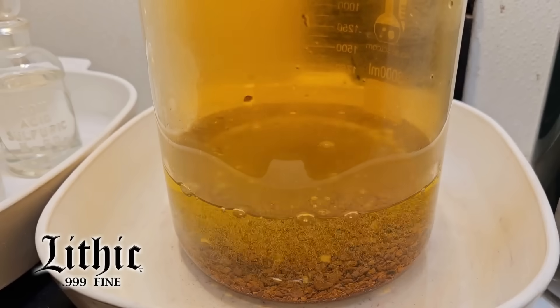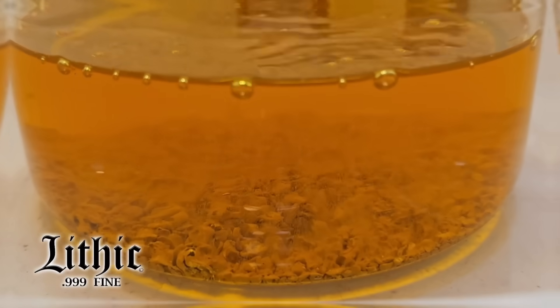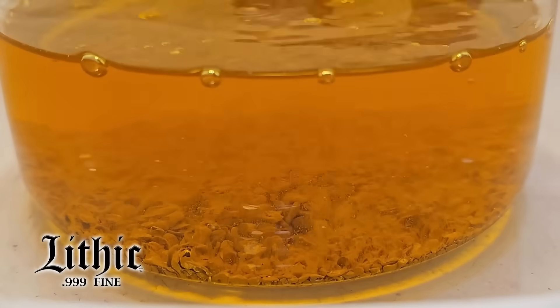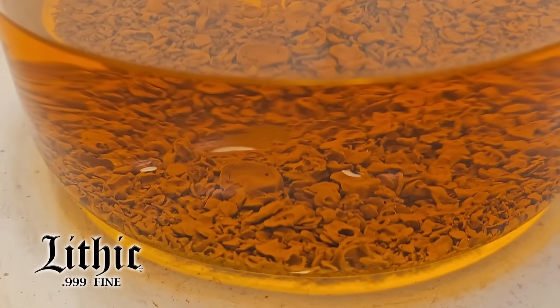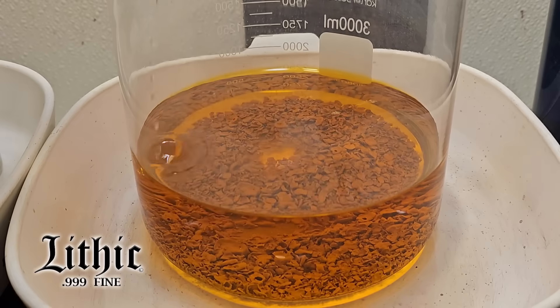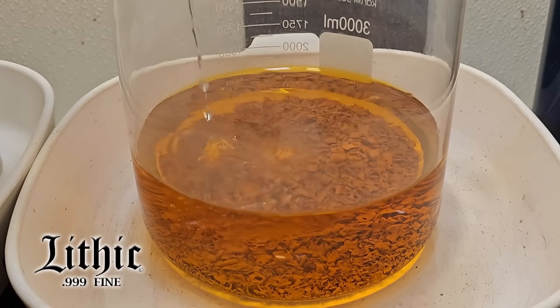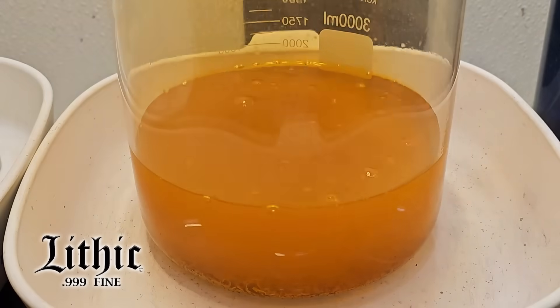I added the hydrochloric acid, then nitric acid — and here we have aqua regia. We have more of those NOx fumes coming off, and we see the gold going into solution. As the reaction stops, I let it cool, add more nitric acid, get the heat going again, and we see the reaction continue.